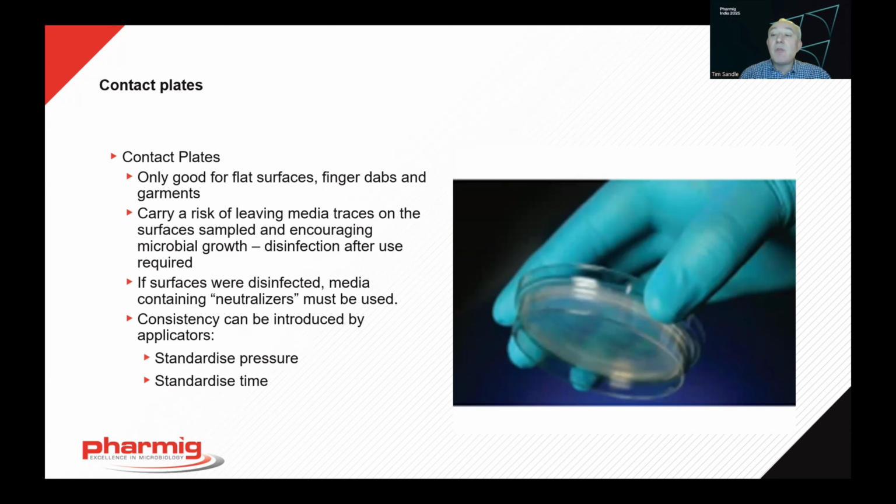It's also important to try and standardize the time that we place the contact plate on the surface. 10 seconds is pretty normal for the industry. And if we can control pressure, then that's good as well. There are some devices available that will standardise the pressure, or if not, we need to train staff not only with the technique, the roll-on, roll-off technique, but also with the level of expected force on the surface, and then to time how long the plate is on the surface for.